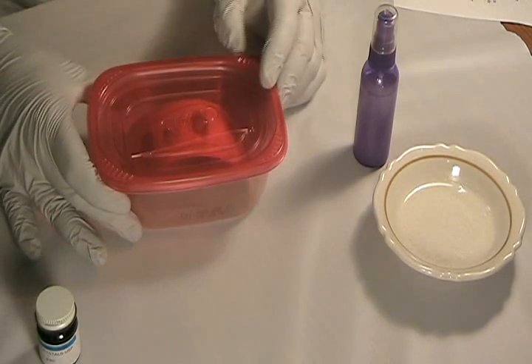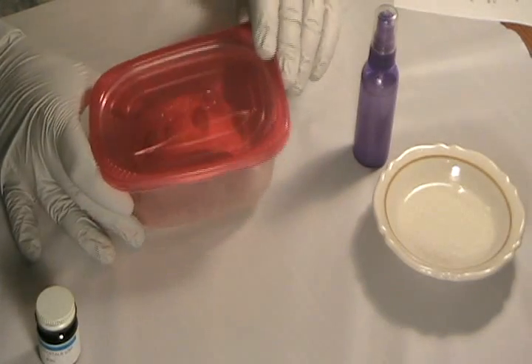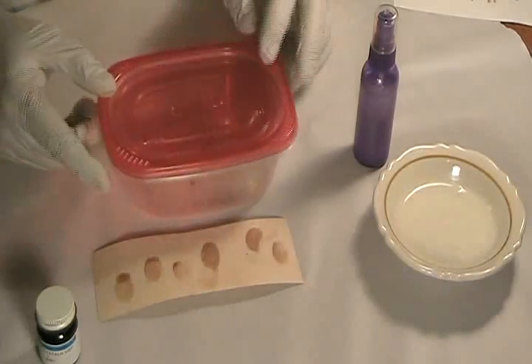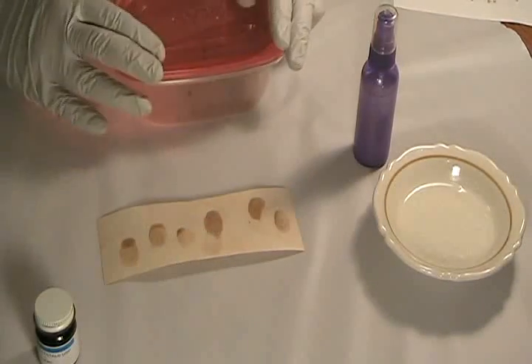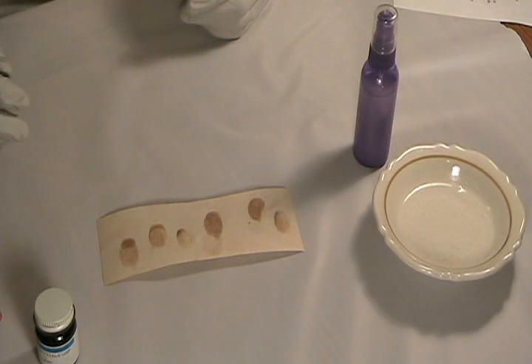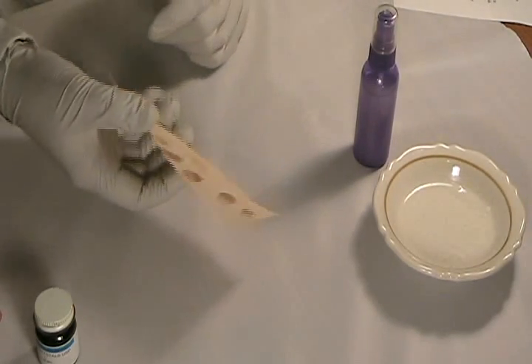We've allowed our specimen to fume for a few minutes. Let's extract it from the chamber. As you can see, we have pretty dark brownish-orange stains. There's quite a bit of ridge detail evident on the prints, and the prints are on both sides of the paper.